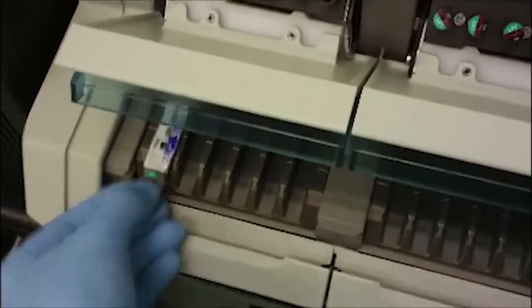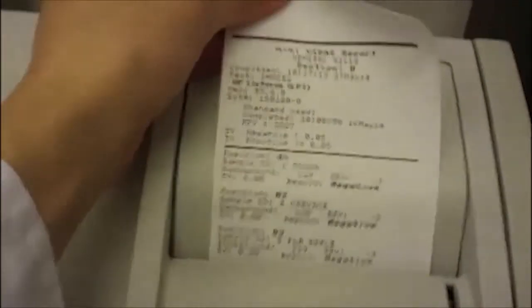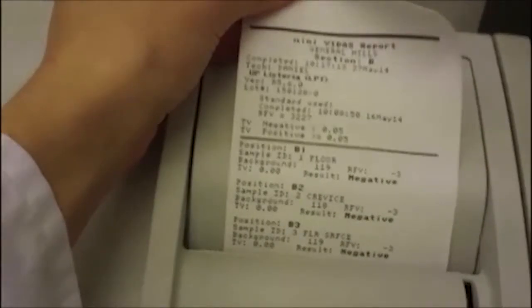The last step is for me to put my samples onto the instrument. After a couple of hours I get a printout with the results, and then I pass on this information in the form of a short report to other people in the company.